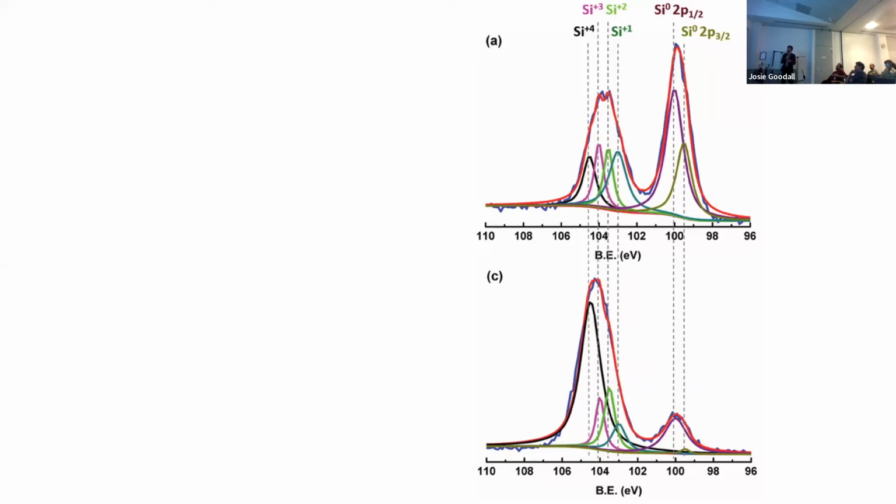I don't have an example of that here. That's not that common because most people get at least as far as reading about spin orbit, so they know that certain orbitals come in two parts. But what often goes wrong is fitting those two different parts, especially when you have multiple chemical environments of orbitals which have spin orbit doublets. It becomes a little complicated.